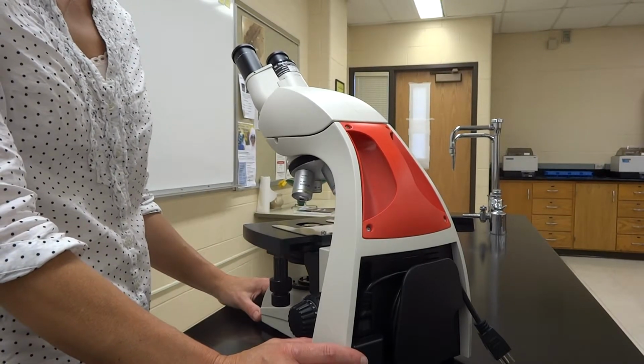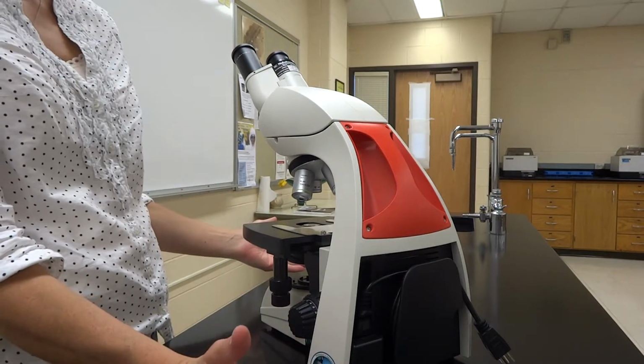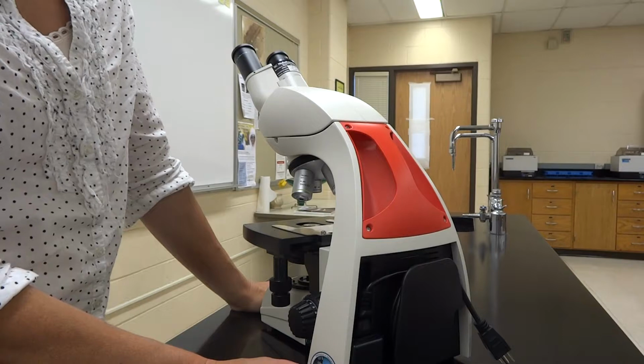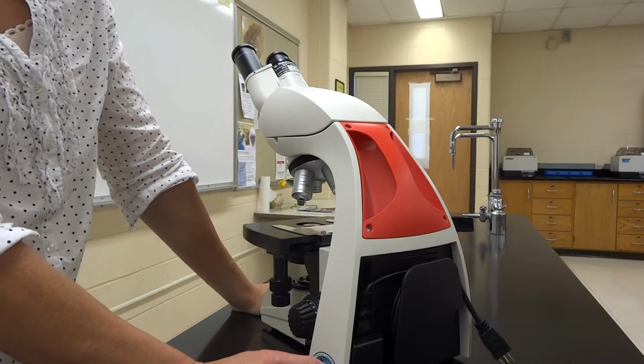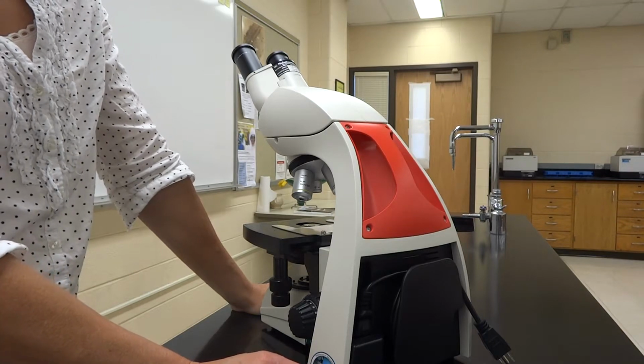All right, now it's time we actually use the scope. Why else would we show it to you? Why learn the parts if we're not going to use it, and use it properly so that you don't want to stab yourself in the eye with your pencil while you're in lab? Because if you don't know how to focus, that's usually how you feel. It's how I feel when I can't do it.